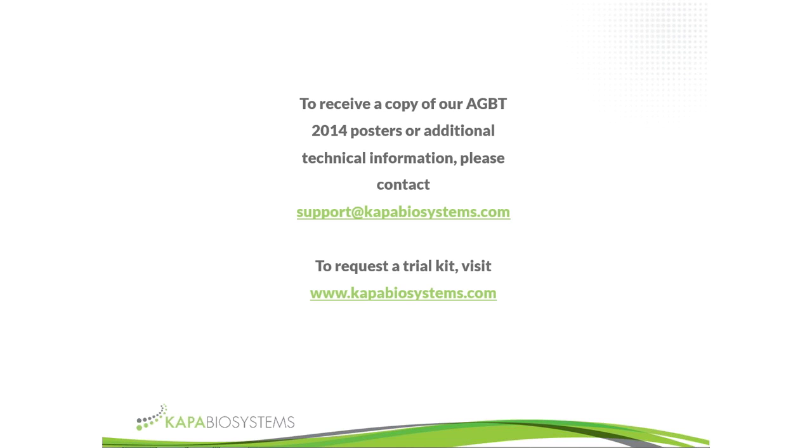Because we know that we can get the amplification reaction very well optimized with the normal Hi-Fi, we really don't want to amplify the DNA that's damaged, since it's going to cause SNPs in the final library sequence. And so what we decided to focus on rather is trying to improve the yields of adapter-ligated library so that you get high library diversity rather than just trying to solve the problem on the amplification end.